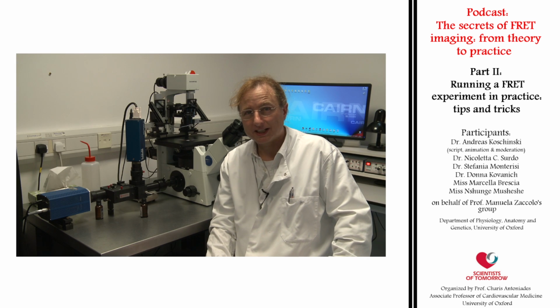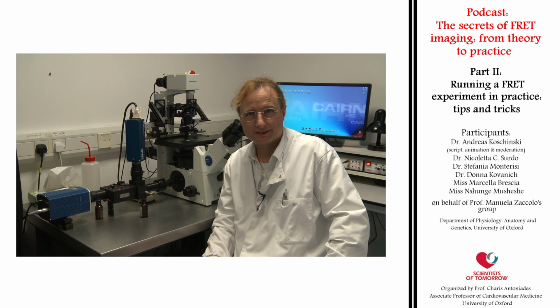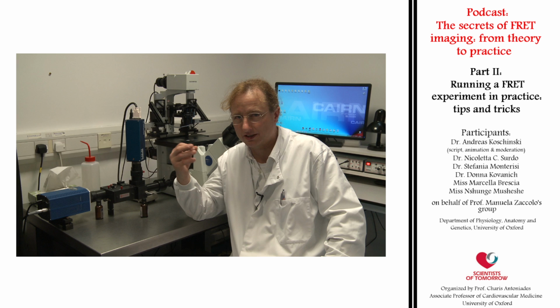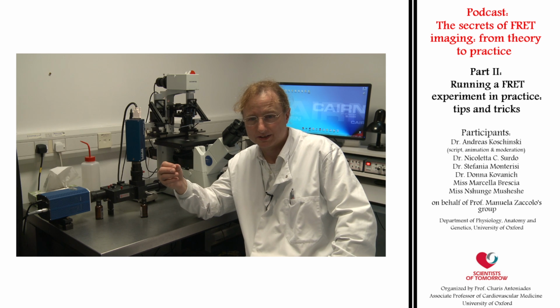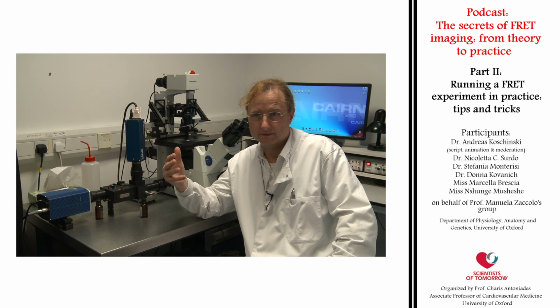Hi. After Manuela had told you in the first part of our podcast the main facts about FRET and what you can do with it, I will give you now some guidelines on how to perform a sensitized FRET imaging experiment. This method does not require particularly sophisticated equipment and can be used by any laboratory. In general, it's perfectly adequate to measure dynamic FRET changes in cultured living cells. In this podcast, we will lead you through the general setup of a FRET imaging system, how to prepare cells for a FRET experiment, the measurement itself with the basic acquisition setup, and the analysis of a FRET experiment.